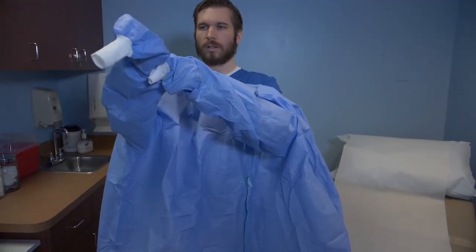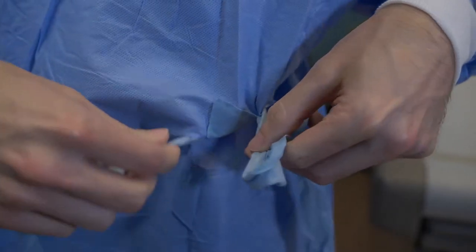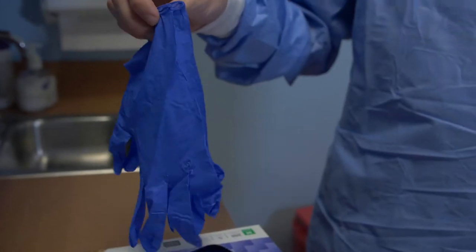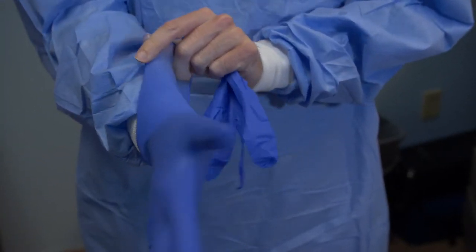Hold the gown in front of you and place your arms into the sleeves. Pull the sleeves down to cover your wrists and tie the gown securely at the neck and waist. Non-sterile gloves can be put on by pulling them over the ends of the gown sleeves, covering the cuffs completely.